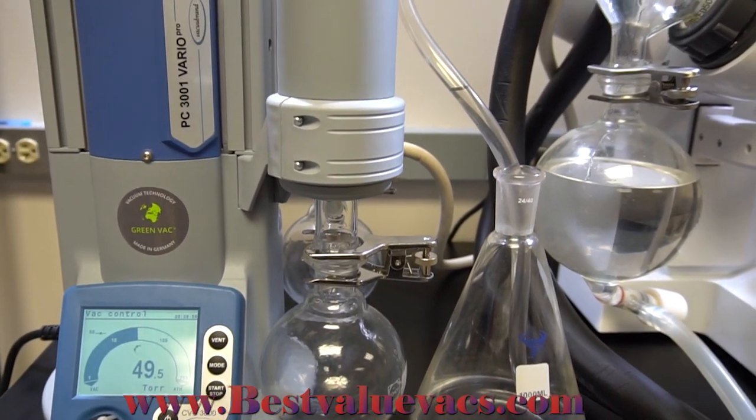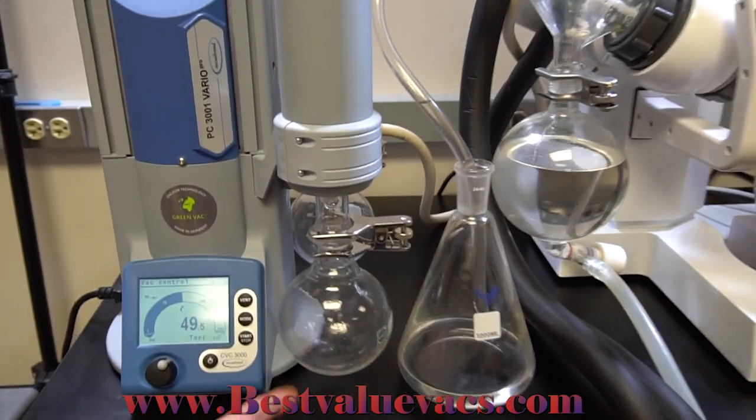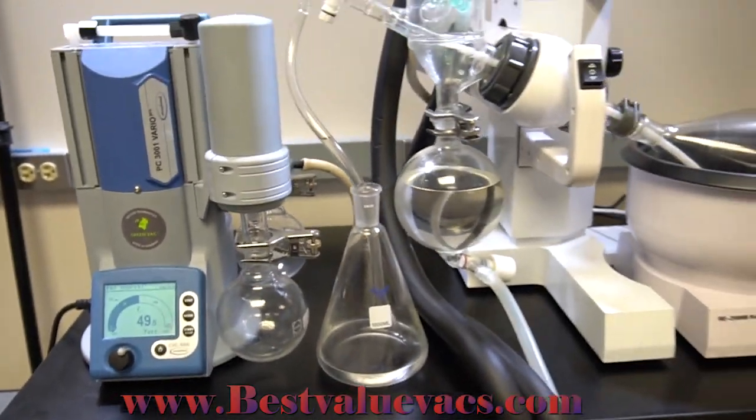There's also an exhaust port at the top of the condenser that can be routed to a proper exhaust. Down here we have our cold trap flask — you can see there's a little bit of ethanol collecting in there. We're currently running this pump with the 2-liter rotary evaporator.